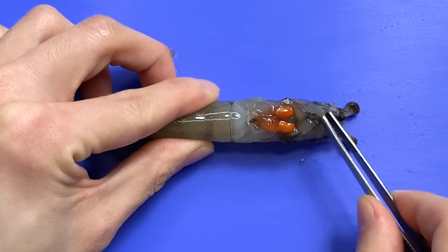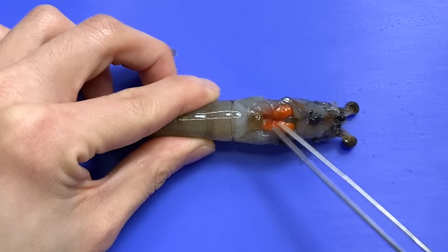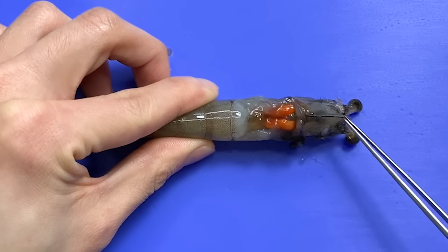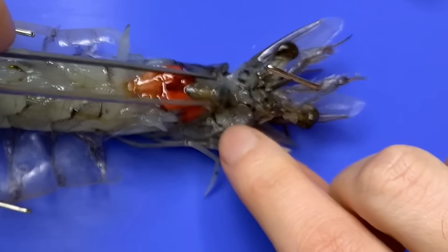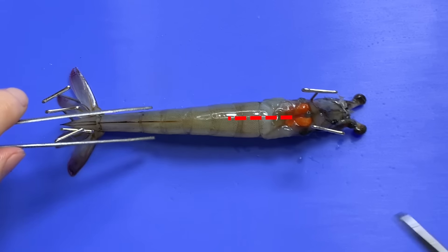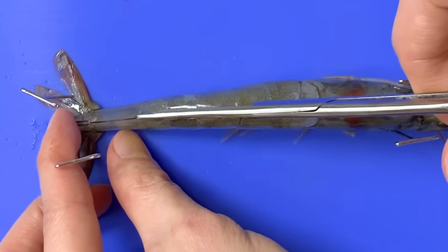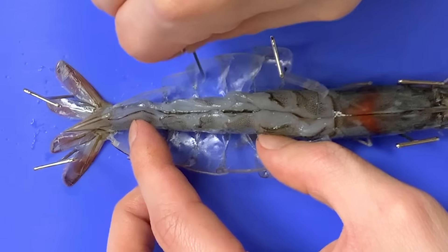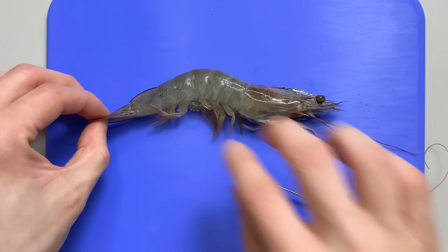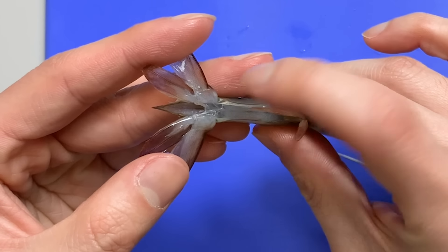Now, let's look inside the shrimp. If you look under the carapace of the cephalothorax, you can see the gills. If you remove the carapace, this is what the inside of the cephalothorax looks like. This is the heart. The orange part under the heart is the hepatopancreas — the digestive gland of arthropods that secretes digestive enzymes. There's a stomach at the top of the hepatopancreas, and the intestines lead to the shrimp's abdomen.